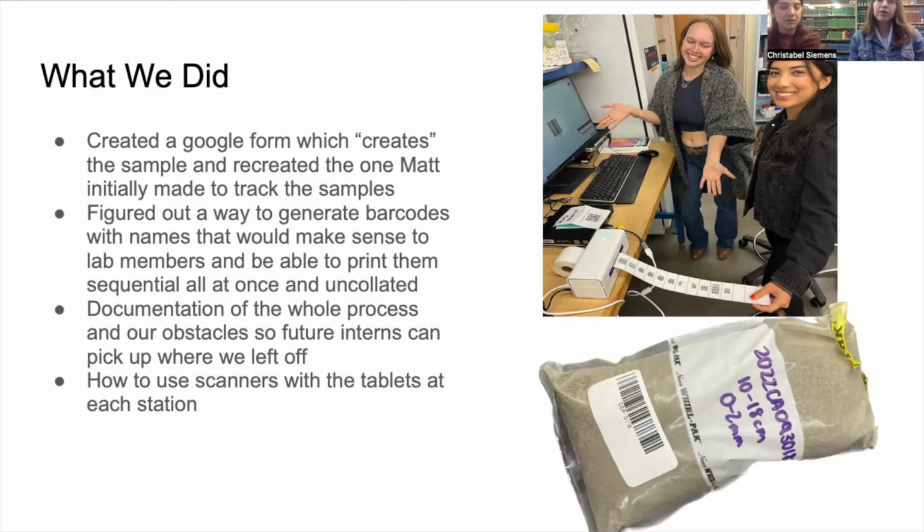Another thing we worked on was figuring out a way to generate the barcodes with names that would make sense to lab members and be able to print them sequentially all at once and uncollated. Basically, what that means is that we needed to have a consistent way of creating a unique identifier for each sample that we could print into a barcode.